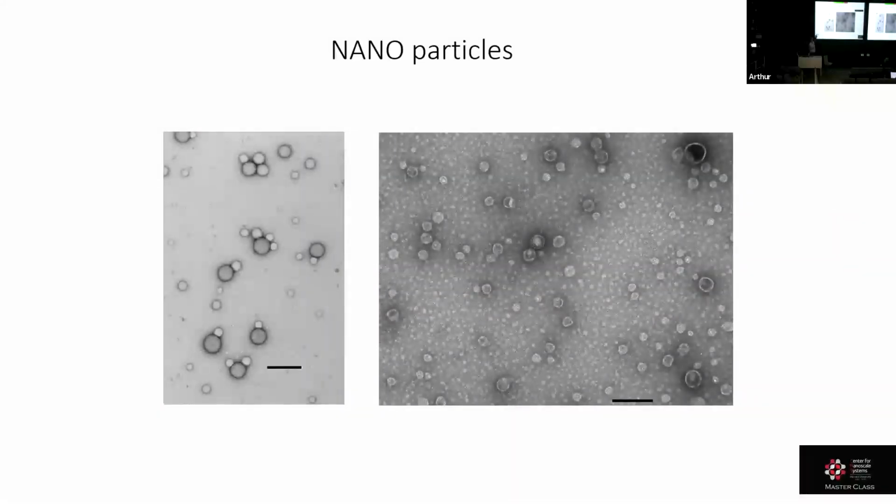Again, we've got some latex nanoparticles on the right. We see no structural damage here. There might be some aggregation going on. We don't know if that's because they actually do aggregate or if it's because of sample preparation. We can't tell that by looking at it.